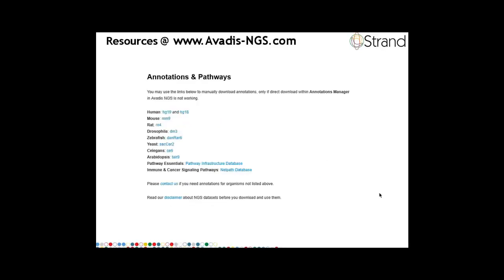As I mentioned earlier, we provide comprehensive annotations. We take gene and transcript models from UCSC, Ensembl, and RefSeq. We make them available on our annotation server, so you can download them with a single click. We also provide annotations for a whole lot of other organisms. And if the organism of your choice is not there on our annotation server, you can always create those annotations within the tool itself, starting from GenBank files.